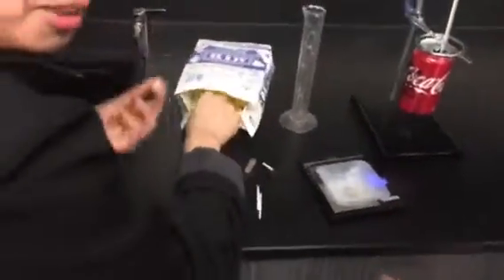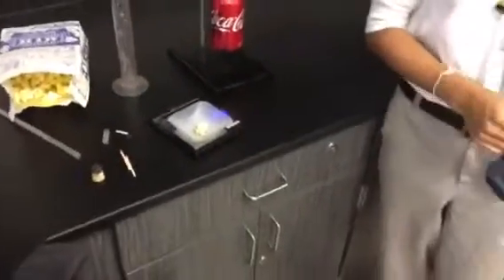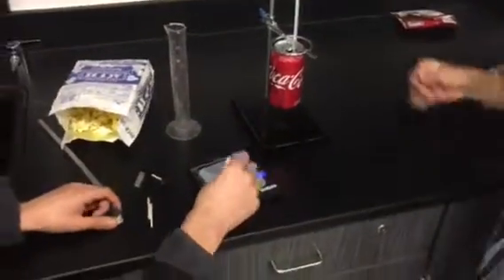Okay, measure the mass of the popcorn again. Let's choose a thick one. How about this? Is this okay? Yeah, that was good. Wait, what do you do? You have to measure the mass. Okay, 0.3. 0.3? Yes, ma'am. Hold that thought. We good? You said 0.3, right? Yeah.